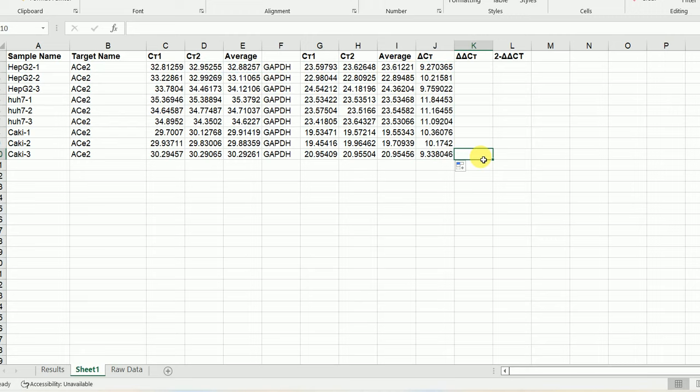Now we have our delta Ct values. The next thing I'm going to do is calculate delta-delta Ct. To calculate the delta-delta Ct, we have to calculate the average of the delta Ct value of our control sample. Our control here is HepG2 — HepG2-1, HepG2-2, HepG2-3. These are our controls, marked here in yellow.